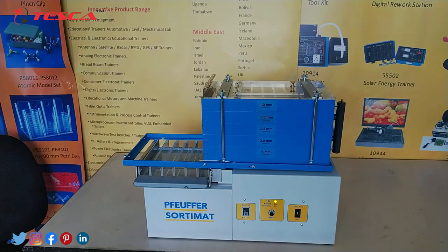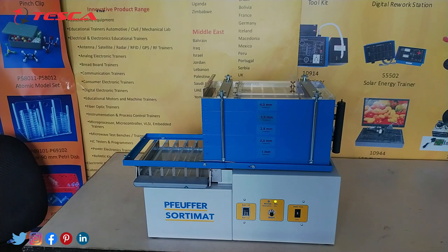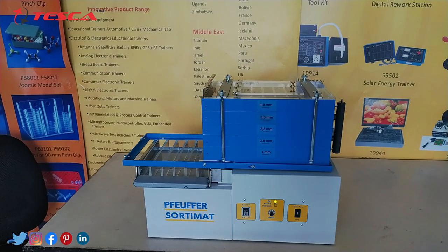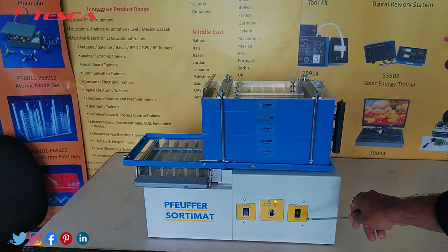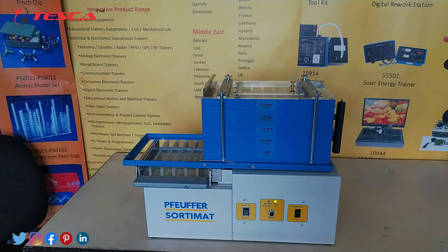Some points to keep in mind regarding this apparatus: we should take a sample of 100 grams only at a time. The products which we can sort through this sorting machine are cereals, leguminous crops, oilseed, and similar bulk goods in granulate form. The sorting time should be between 1 to 9 minutes, and you should repeat the procedure 2 to 3 times.